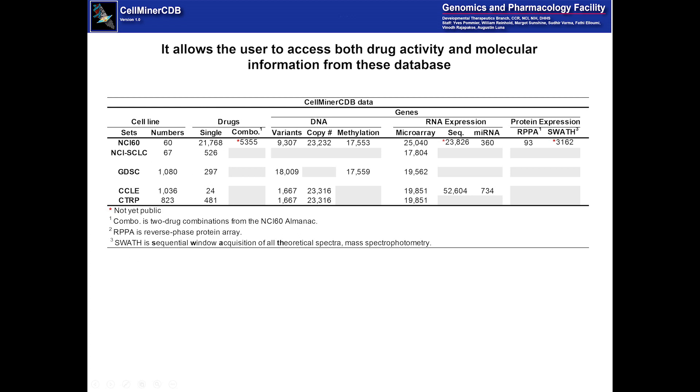It allows the user to access both drug activity and molecular information from these databases. So this is the information that's currently present. You see there's lots of molecular information for the NCI-60 and lots of drug information, many more cells for the other cell line databases.